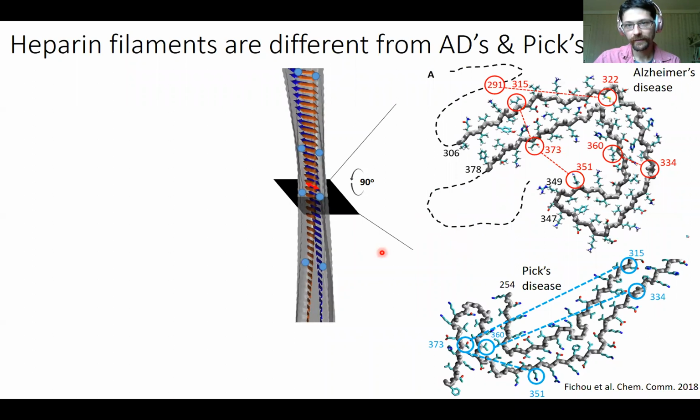To answer this, the design of the experiment is such that we place several labels, obviously 2 at the same time. Each of those distances is 1 different mutant, 1 different sample, so that you can probe some key distance. For instance, this one will probe the C shape. Also the beta solenoid could be probed by this.